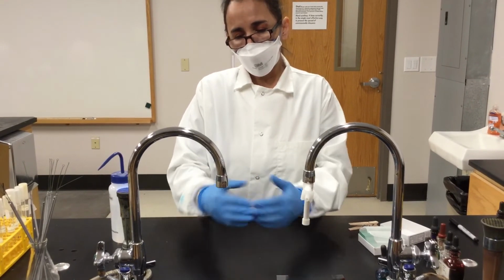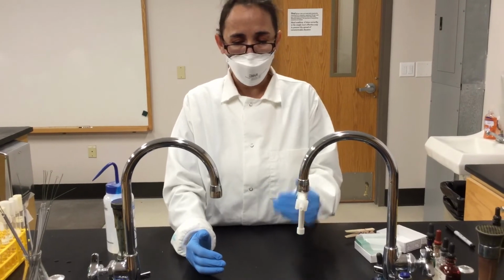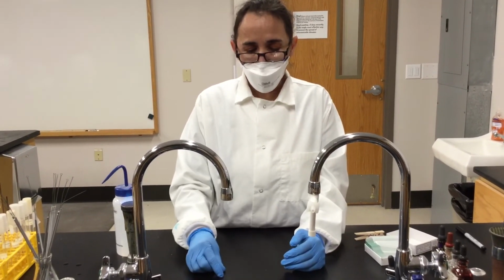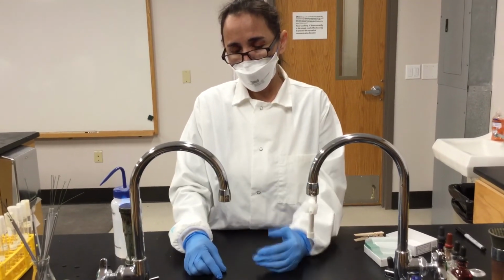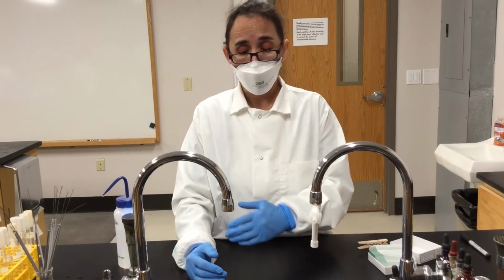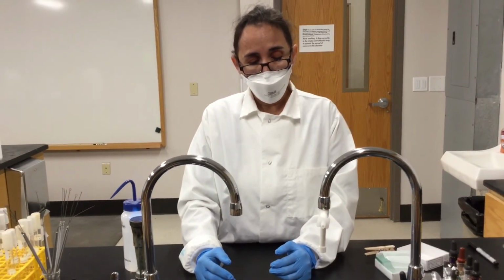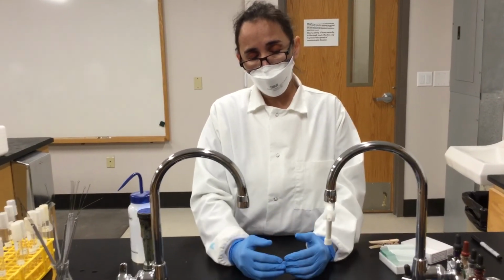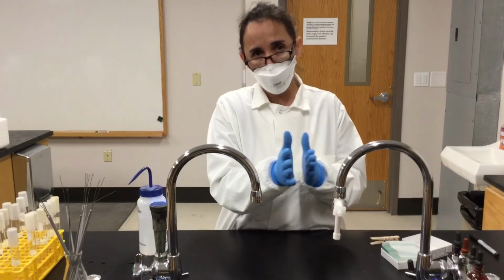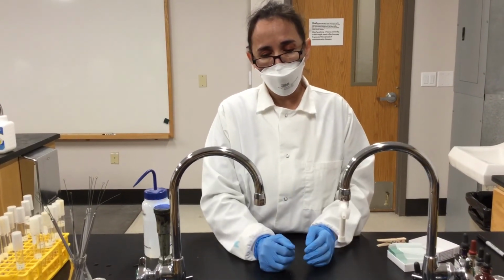And this is the reason then why gram-negative stain red and gram-positive stain purple, because these gaps that you open with the decolorizing agent in the peptidoglycan from the gram-negatives make this crystal violet iodine complex escape. And with alcohol, the decolorizing agent in gram-positives, you trap them because you actually seal the peptidoglycan layer as you are dehydrating the peptidoglycan with the alcohol.